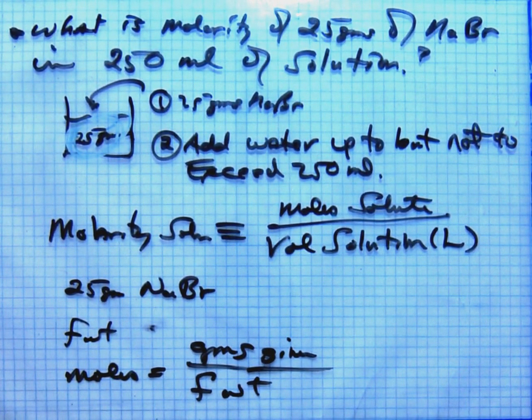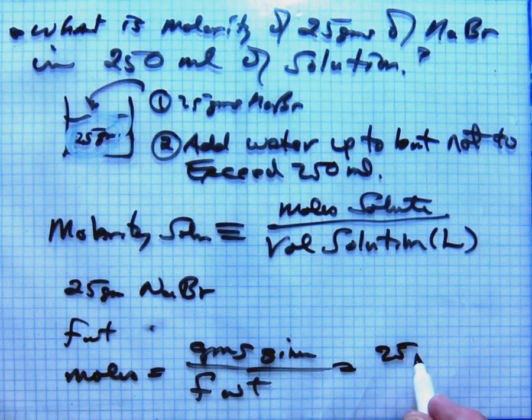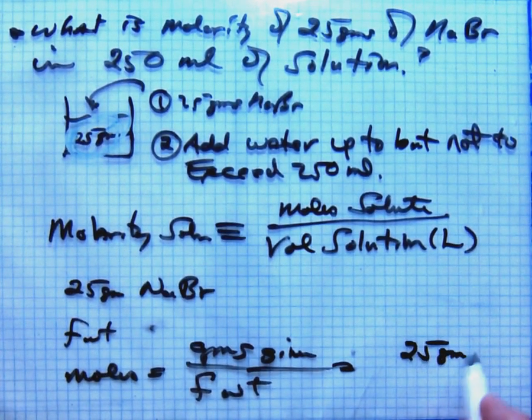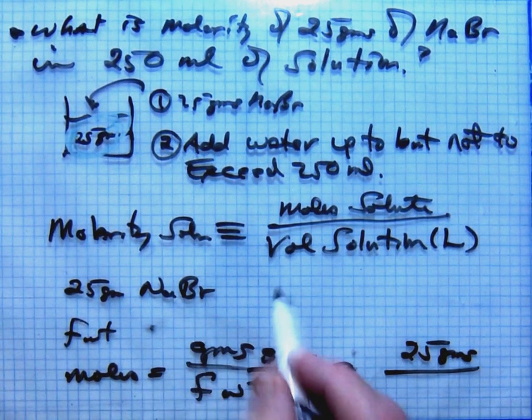And so that will be the moles in 250 milliliters. So I have 25 grams. Now I need the formula weight of sodium bromide.